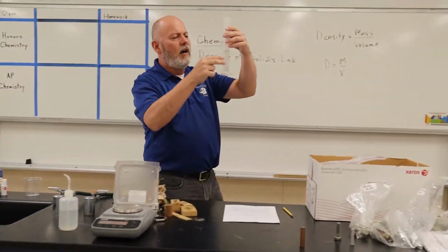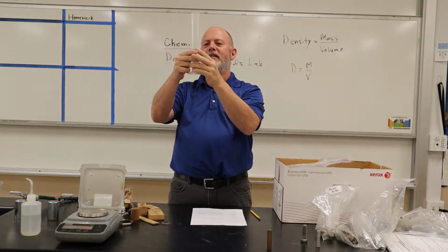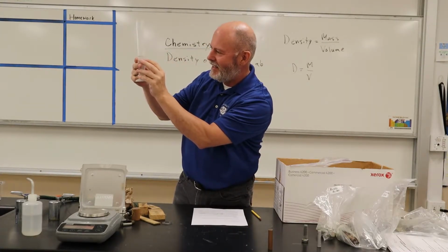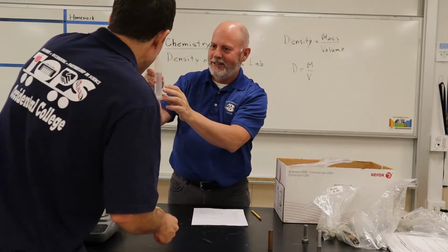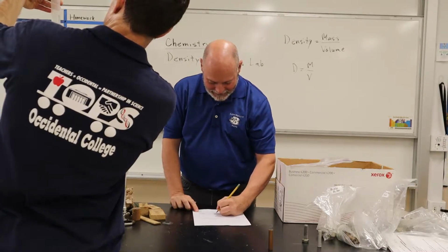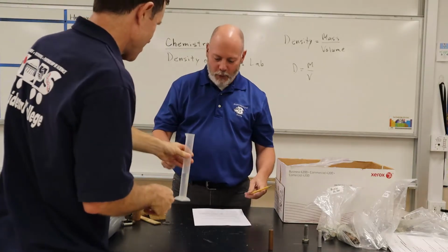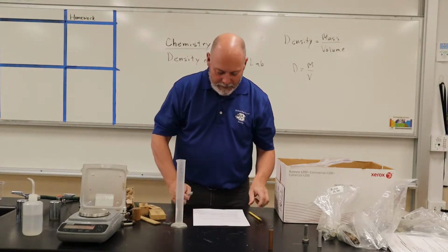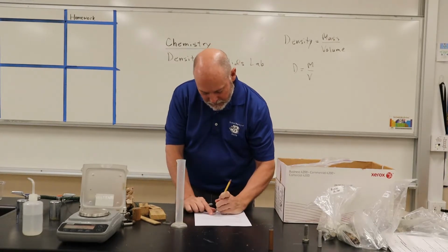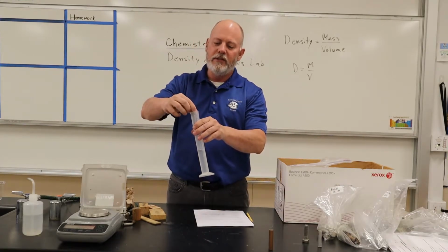All right, so we're starting this time at 46, 47. It's like about 46.5. We'll do 0.5 on that one, 46.5. So that's for the iron bolt, 46.5. So now I'm going to drop it in gently.